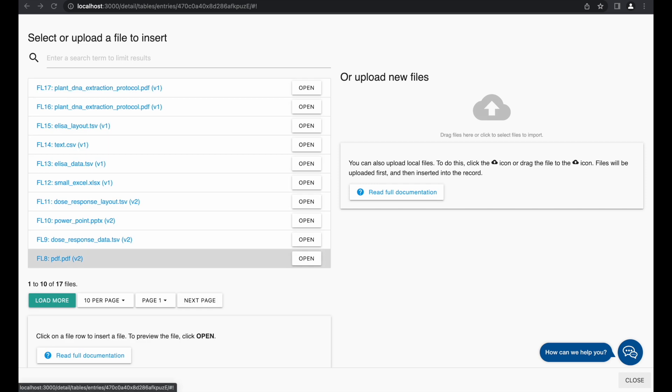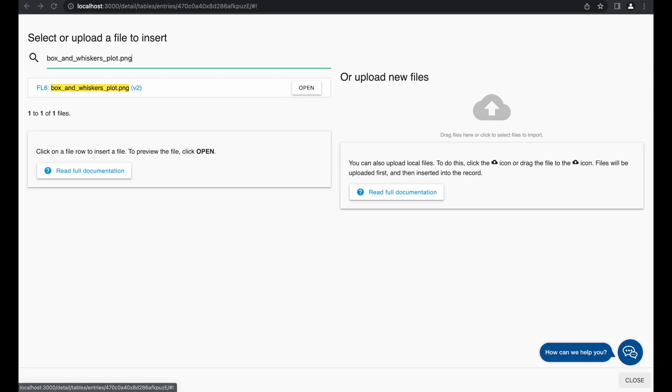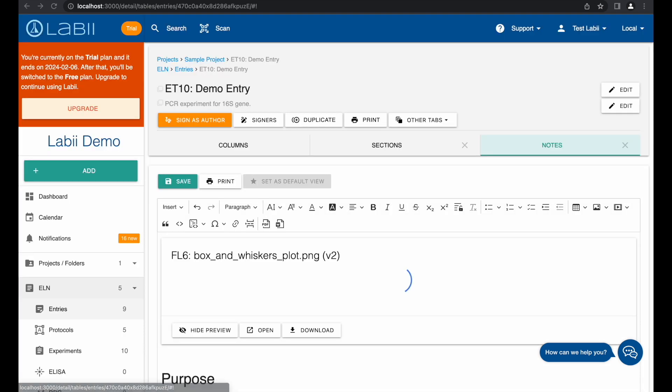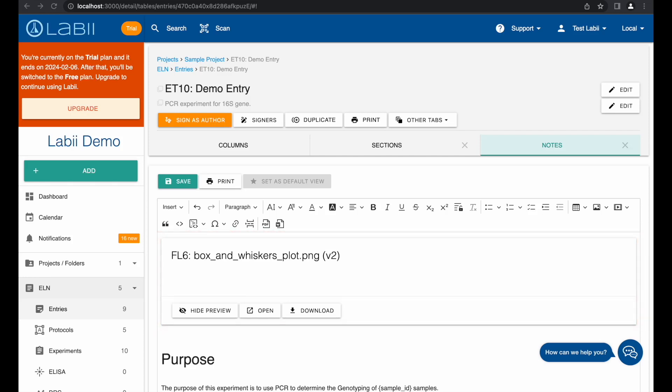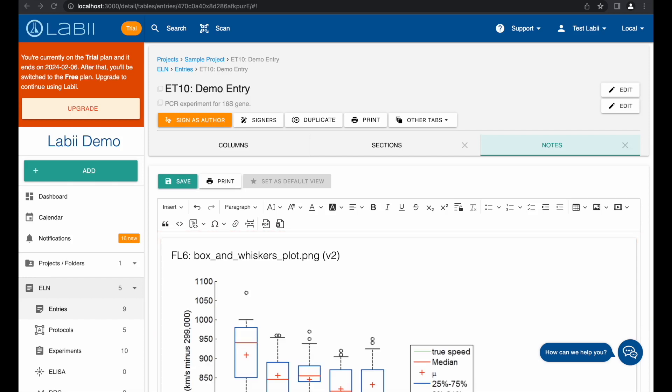In the pop-out window, you can search for an already uploaded file. You can also drag and drop files to the cloud icon. After inserting the file, you can hide the preview, open the file, and download it.